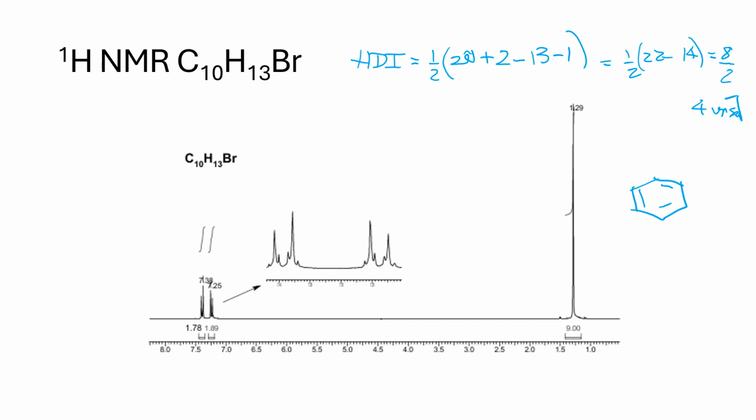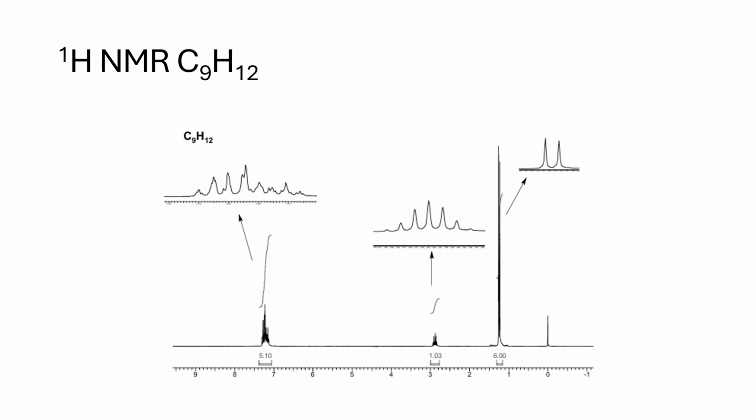The other thing is that we see these patterns, so it's likely to be disubstituted in para. Now, one of them is the bromine. And here I have used 6 H's, so I still need 4 more. And this is here, very large. These are 9 H's, so it's already giving me that this is a tert-butyl. That's why. Okay, so now here we have C9H12.